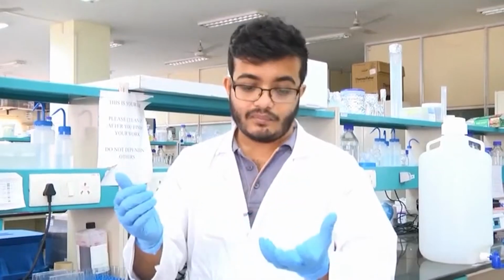Once you have these competent cells and you add your DNA, DNA being negatively charged now gets attracted to the positively charged divalent cations present on the bacterial cell wall. Keep in mind that this is a very simplified explanation of how to make competent cells. You will learn these in detail elsewhere.